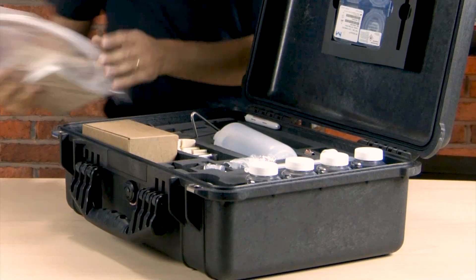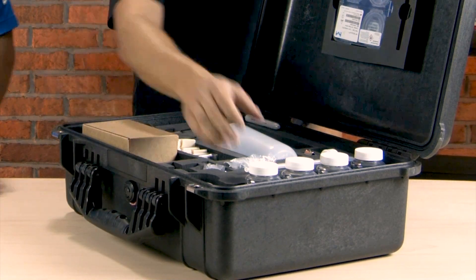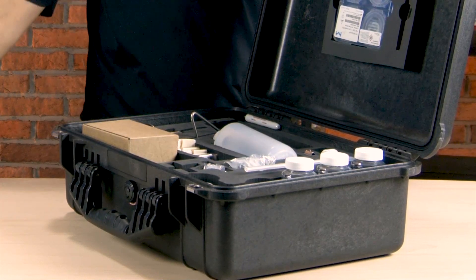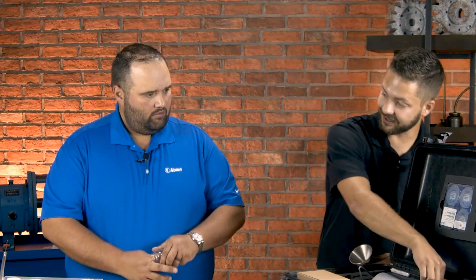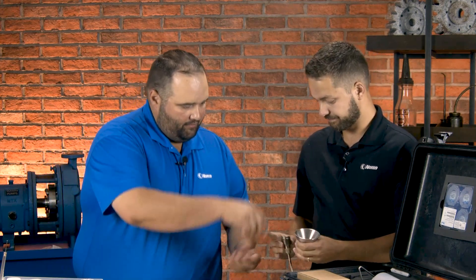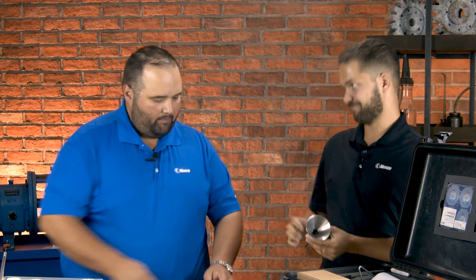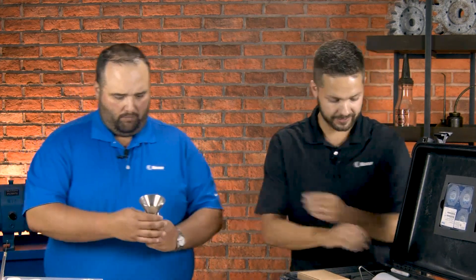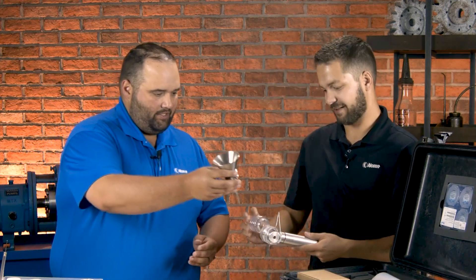So what do we got? We got miscellaneous things here — some tubing of course, and some paper where you could write your patch test information. They've got some bottles — these are the waste bottles. The main component here is the funnel itself. This funnel is what you'll attach to a vacuum sampler. You can put the perforated material right here that allows you to put the patch on top of it. The patch goes on top, it threads together, and that basically keeps the patch from being damaged or sucked through the sample. That's better than a lot of the plastic ones — it'll last a lot longer.